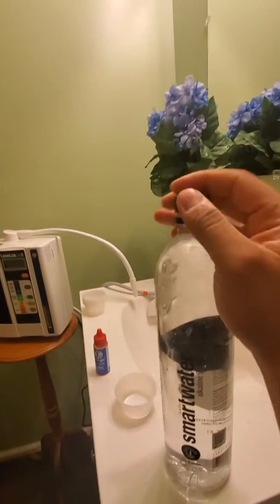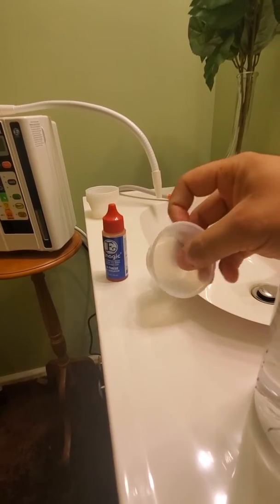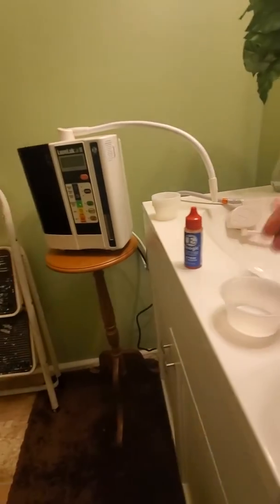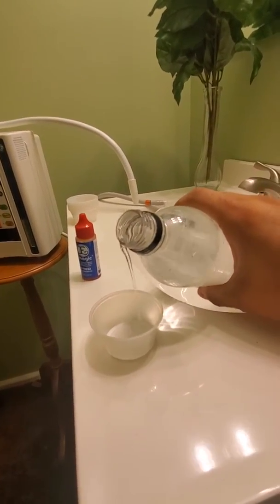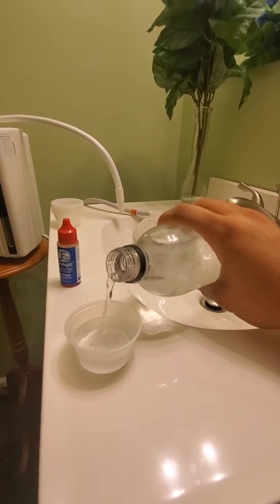Let's open it up here. Pouring it into a clear sample cup — nothing's in it. All right, let's get it in there. There we go, yeah, nice.